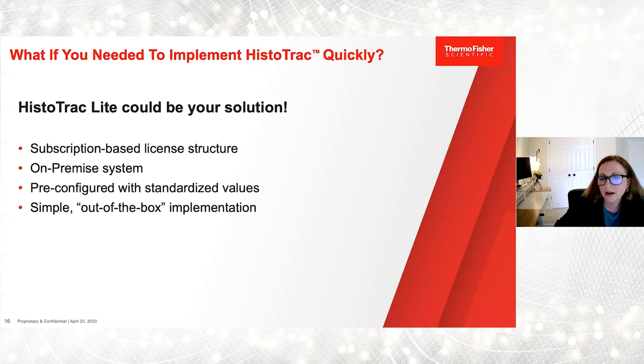So within HistoTrac, to implement HistoTrac, it's a pretty complex system. It's a process that requires us to get to know the intricacies of your workflows and your system. And we recognize that that's not a solution that works well for everyone. And so what can we give you if you need to implement HistoTrac quickly, or if you are a smaller lab and you're just not that complex? You don't want all the choices that sometimes come with this.